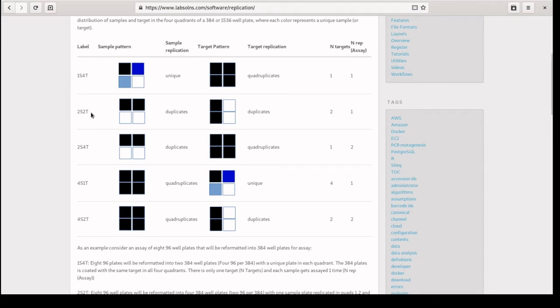Note that when using LIMS Nucleus, you must use one of these 3 patterns of sample replication, either N of 1 with different plates in all 4 quadrants, N of 2 with replicates horizontal across columns, or a single plate in quadruplicate. Other patterns like 3 and 1 are not supported.